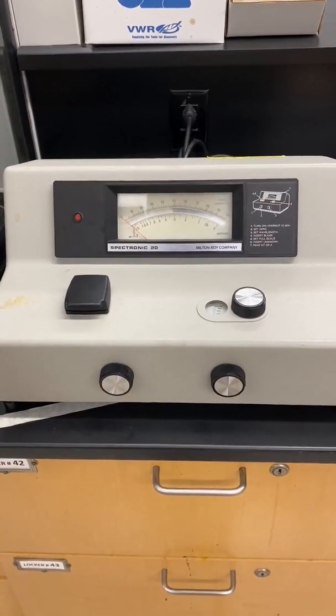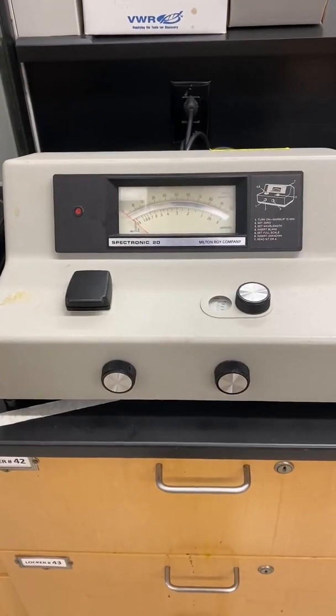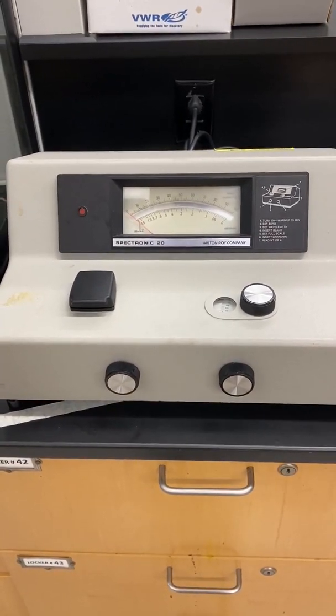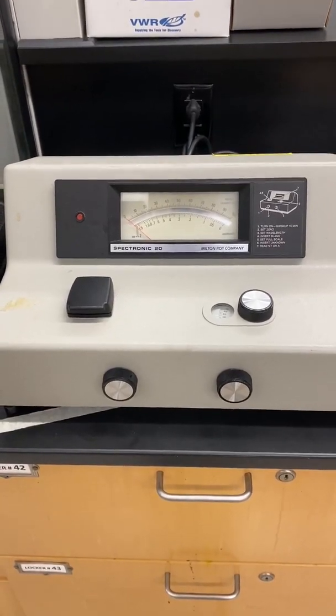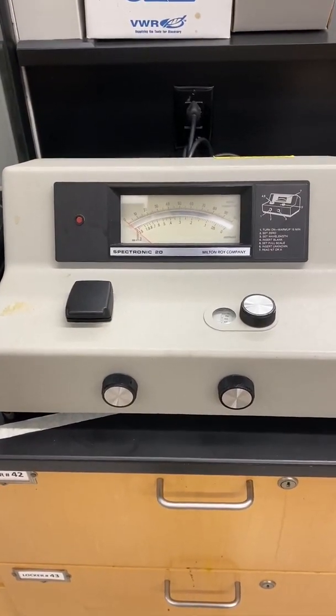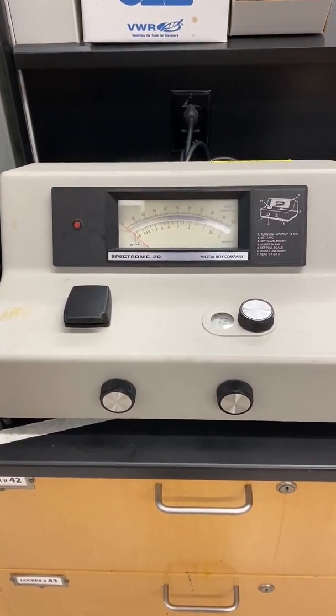In experiment number four, we're going to use the spectrometer known as the SPEC-20 to determine the percent iron in an unknown sample by making a Beer's Law plot using known concentrations of ferrous ammonium sulfate solution and converting it into a red-orange colored iron-phenanthroline complex.